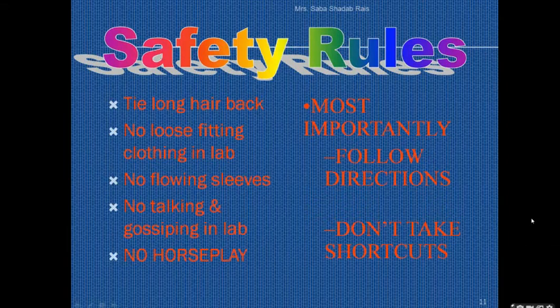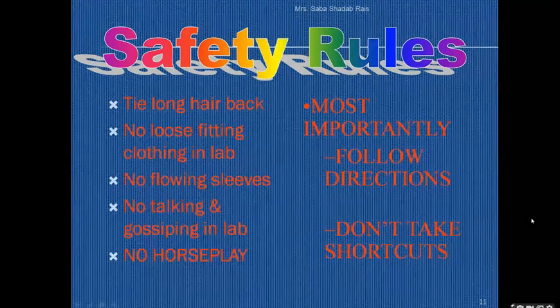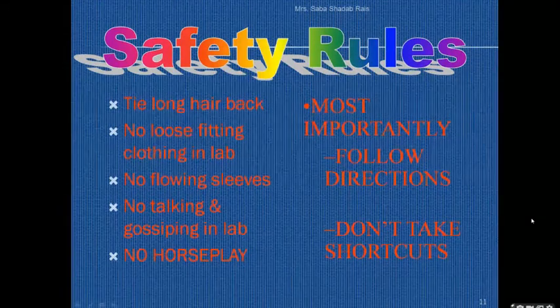Now see, flowing sleeves. Nowadays they are in very good fashion. Girls wear them, and I have seen boys also wear flowing sleeves. You should not wear any flowing sleeves into the laboratory. If you are wearing them, then you should tie them properly, because they can catch fire very easily.